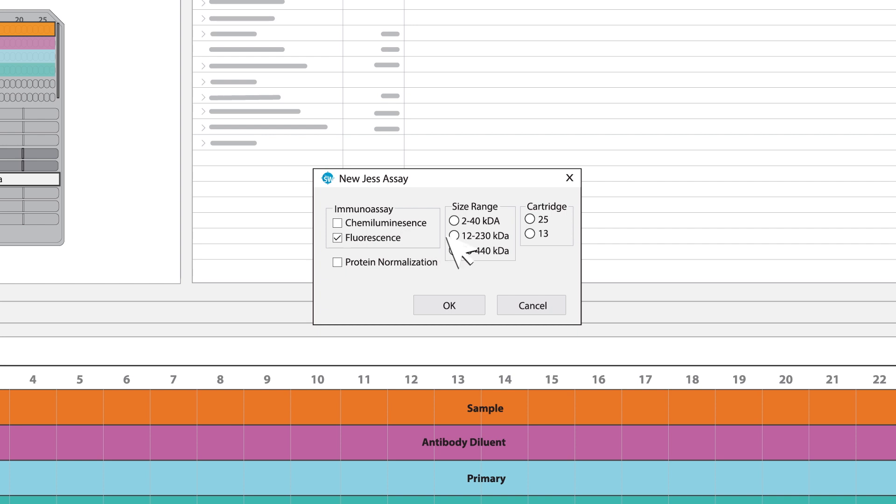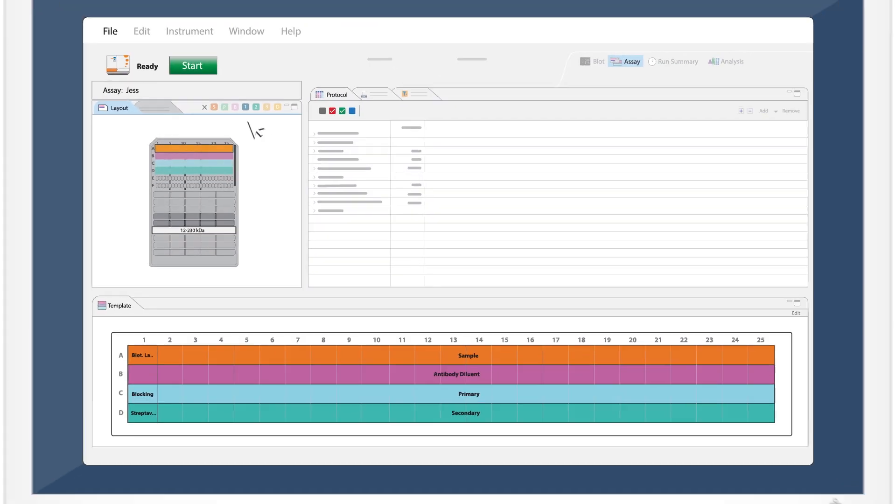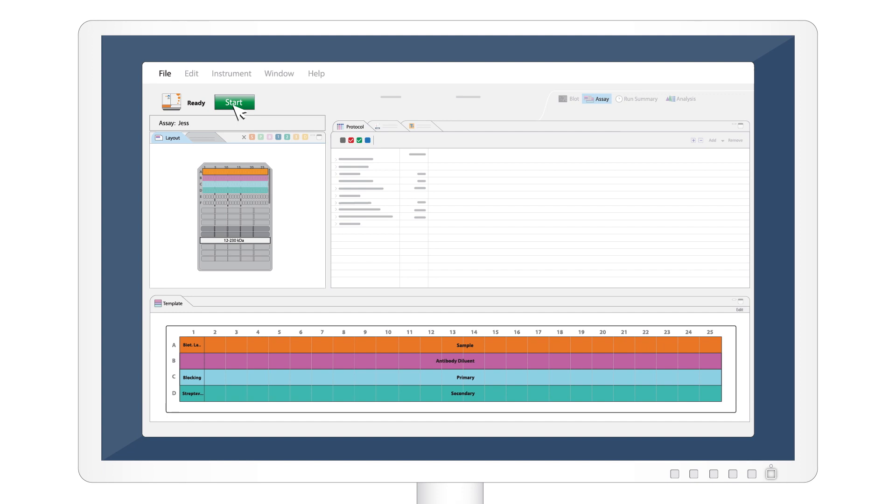Select Size Range, 12 to 230 kilodaltons, and Cartridge 25. Then click OK and start.